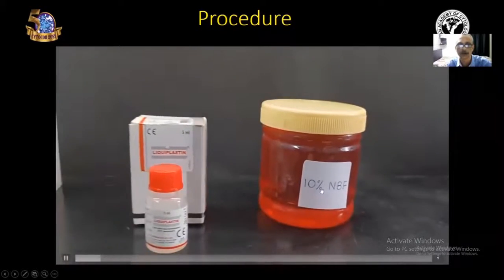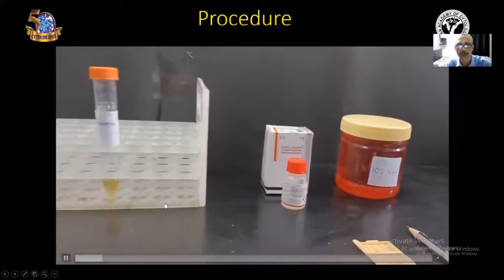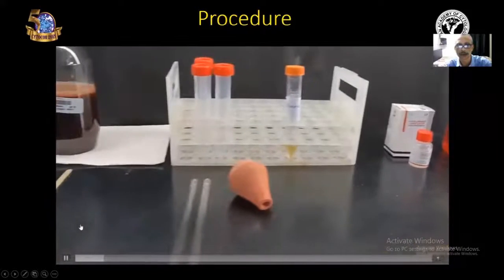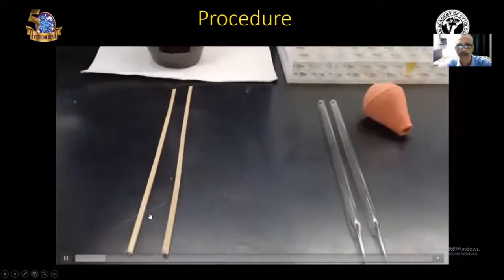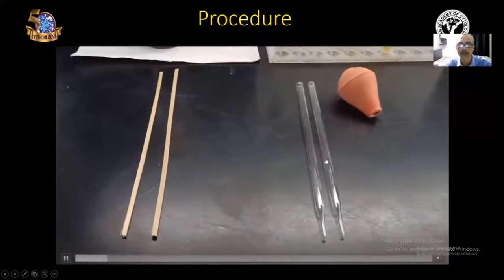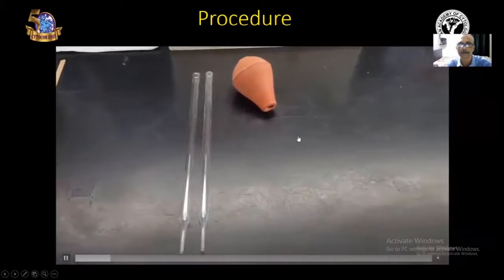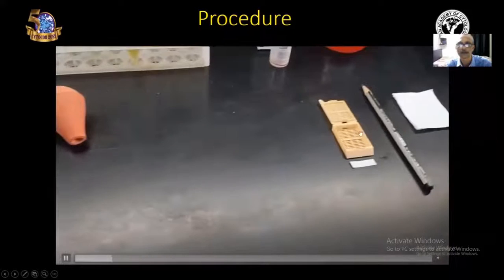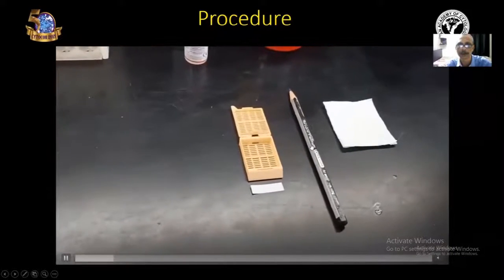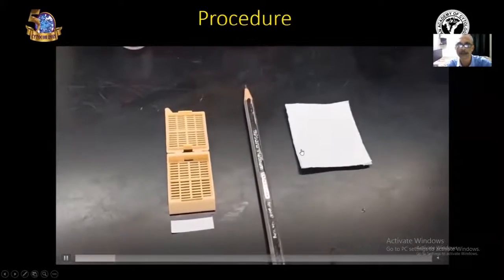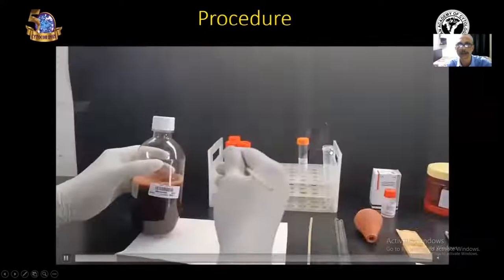And also, we require applicator sticks for mixing the sample, Pasteur pipettes, tissue cassettes, pencil for labeling, and small pieces of Whatman number one filter paper.